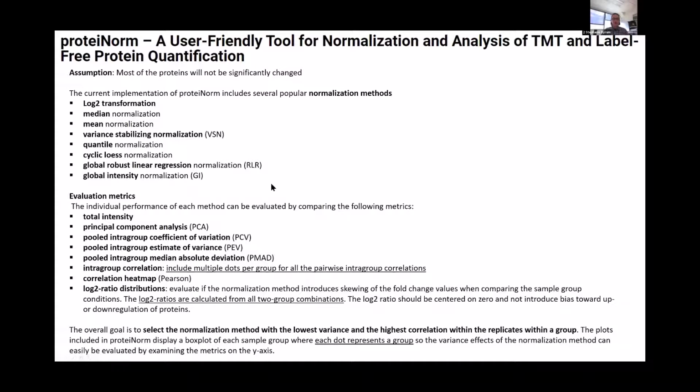This is why eventually I'd really like to have a standard in the data sets, where I know what my ground truth is and we can normalize with that. But that's what I would like.